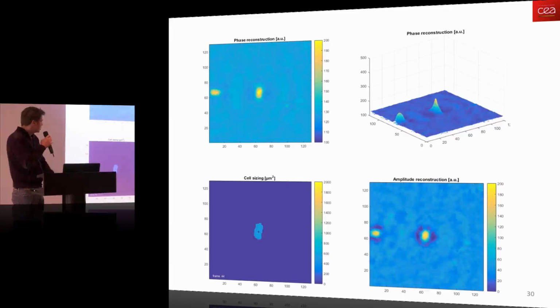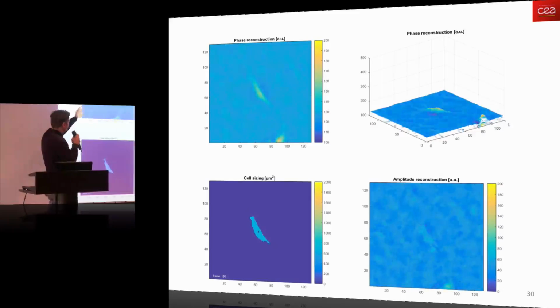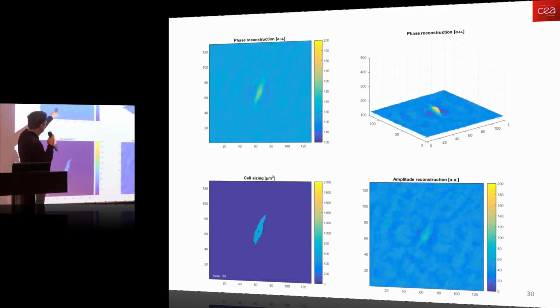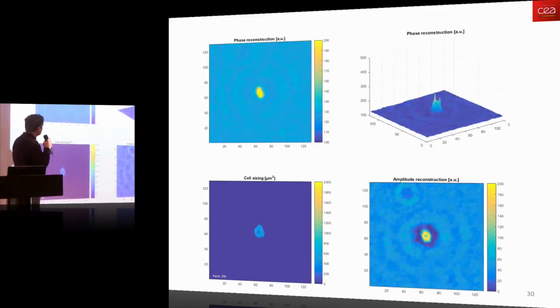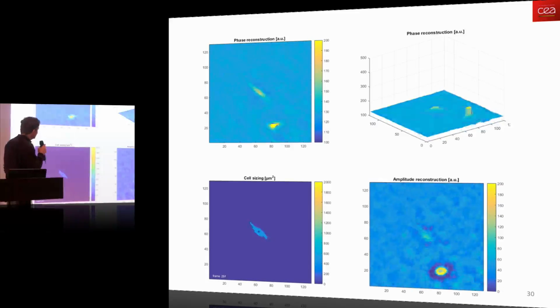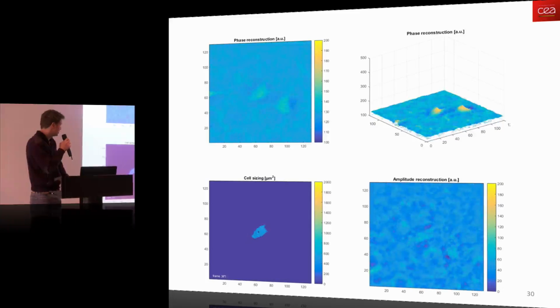And we can also measure all this metric at the single cell level. Here you see a single cell, I mean the mother. You will see the next division. It will divide, yeah, sure. And then you can follow every single cell among this very large population of cells.